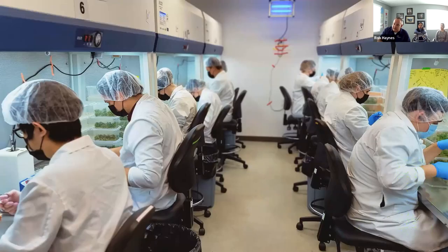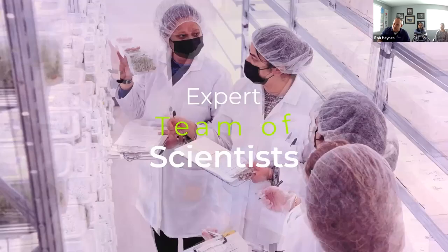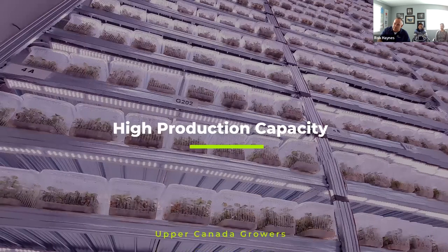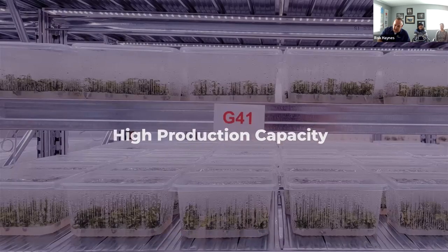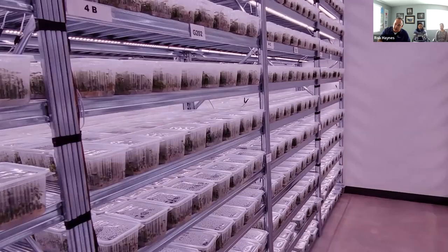The cuttings were then sent to University of Guelph. The University of Guelph set up all of the protocols for us. And when I'm saying protocols, it set up how we actually initiate this, what kind of mediums we need, what we need in the mediums to promote growth, to promote rooting. So that was all set up for us. Once that is set up, they then transfer the product to us here at the nursery in our lab.